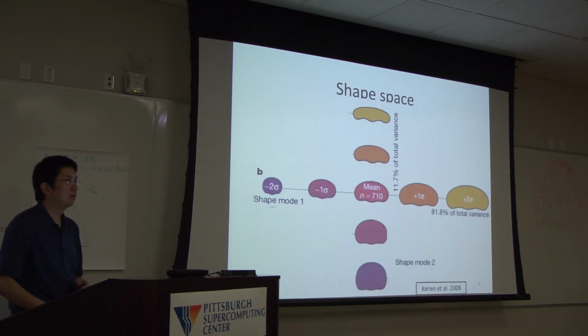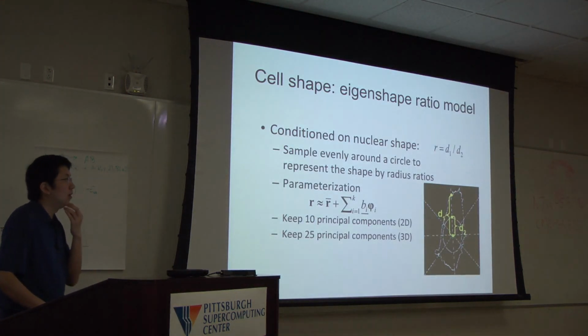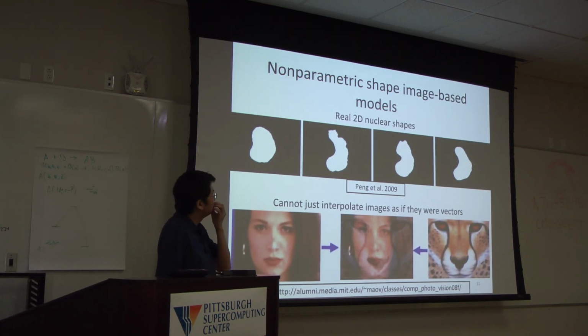How sensitive is this? You're using immunofluorescence data with cells in culture, so you can threshold it pretty easily so there's essentially no background. Yeah, here we use just a binary image for the shape, because we only study the shape. We don't consider the intensity in the cell. For the segmentation, you can choose different methods.